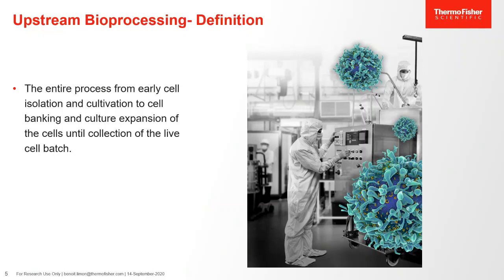The upstream in the bioprocess is the entire process from the early cell isolation and cultivation to the cell banking and culture expansion of the cells until collection of the live cell batch.